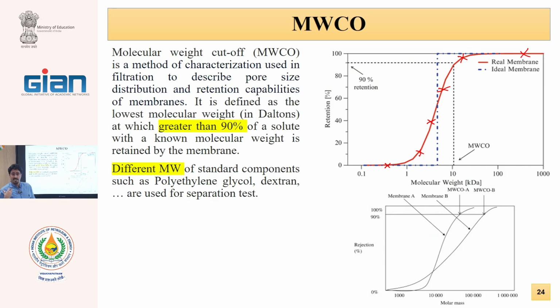If we have an HPLC, we can mix all polyethylene glycols with different molecular weights as one solution and measure. This is very easy, but usually we do not have HPLC. Therefore, we test separately, so we prepare 6 different solutions and begin to test the membranes. With these 6 points, we draw this diagram.